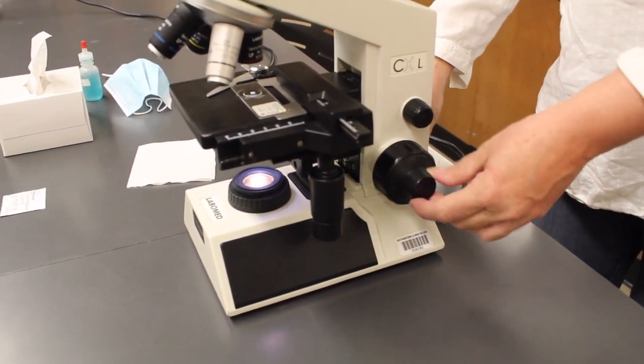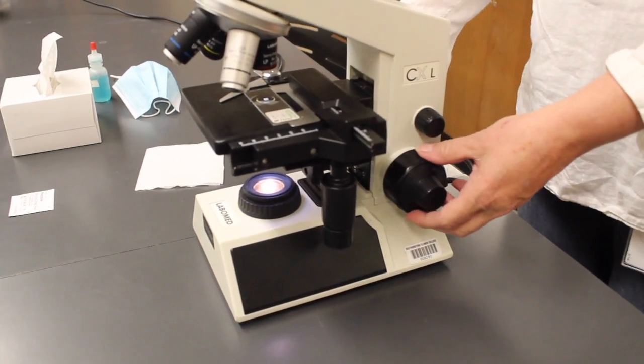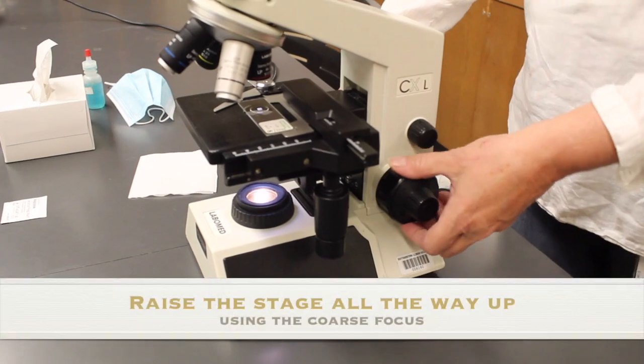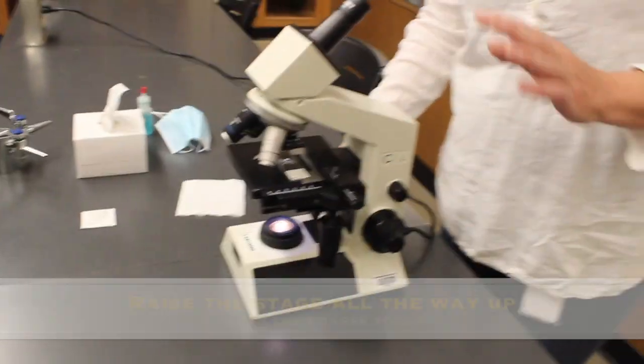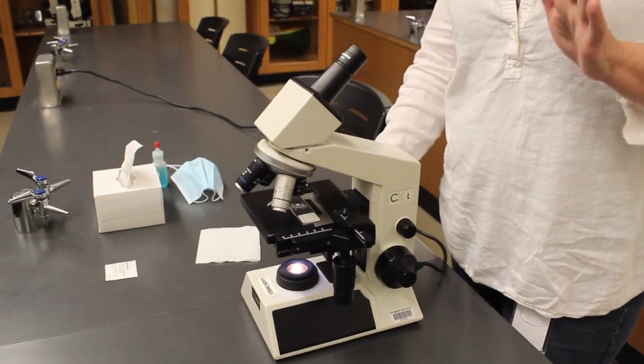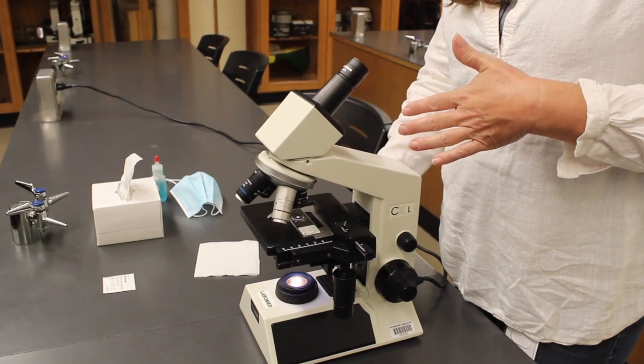If I turn the fine focus, it doesn't really look like the stage is moving up much, and that's because it does very subtle motions of the stage. So here we go. We're going to raise this all the way up to the top. And then the next step is the tricky step. It's kind of fun. I'm going to get it in focus without actually looking in the microscope.